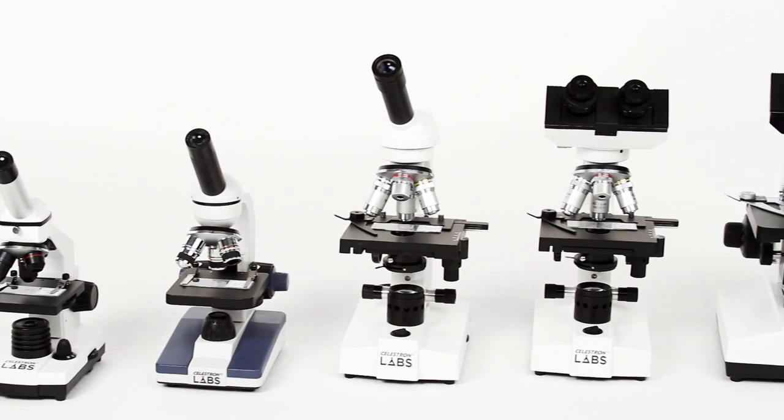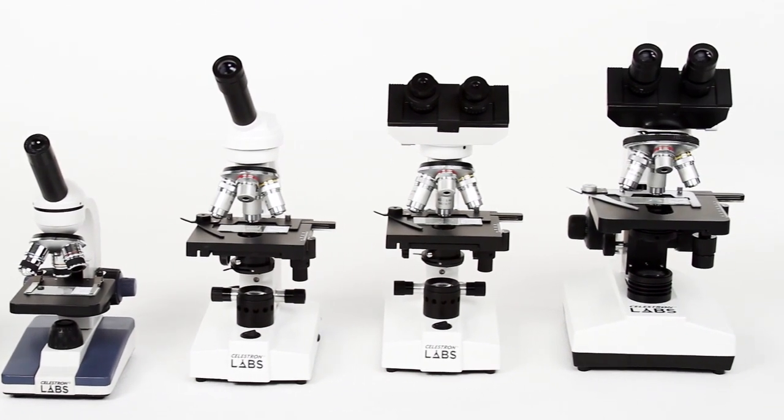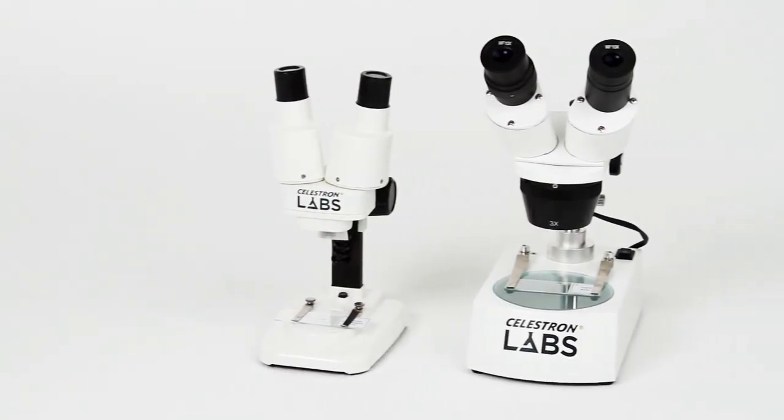Introducing Celestron Labs, a new family of compound and stereo microscopes by Celestron.